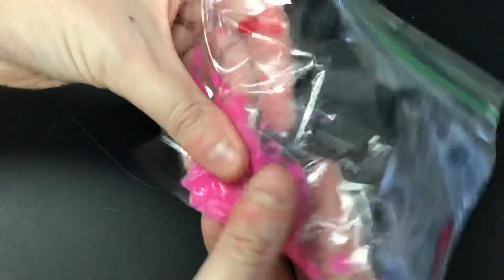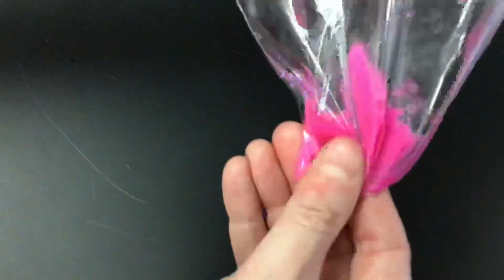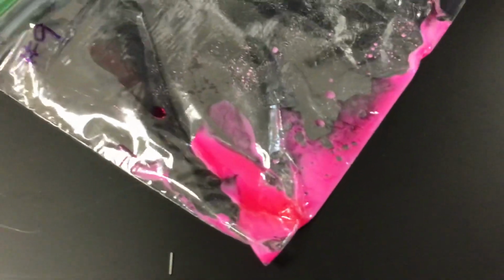Okay, so it's getting cooler. Okay, so quite cold to the touch. So write down anything else. If it looks like it dissolved the solid that was in there, any color changes, make sure you write that down.